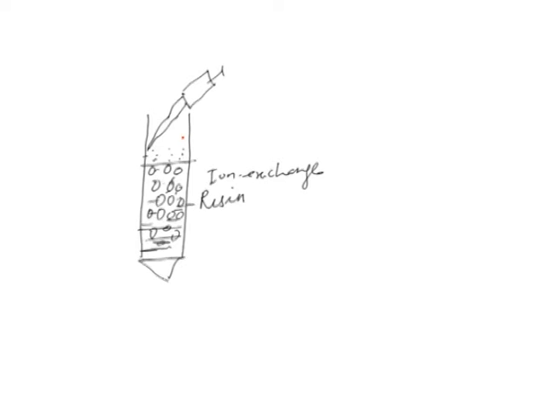So, once you have prepared your resin and loaded your sample, as the sample gets in and contacts the resin, the charges will be saturated. If the resin is positively charged, a negatively charged biomolecule will bind to it and slowly saturate it, and as the beads at the start get saturated, the biomolecule will move in and bind to others. So, it depends on the capacity of this stationary phase, as to how many ionic groups it has.